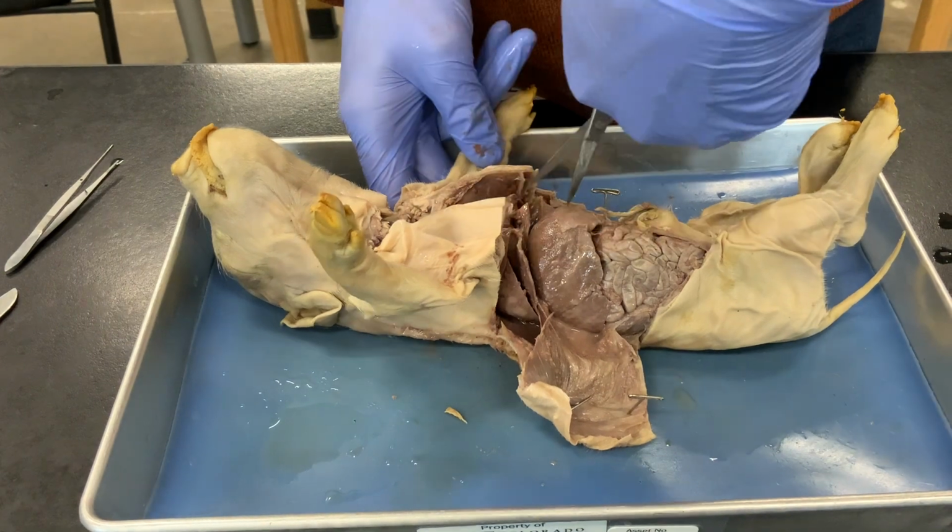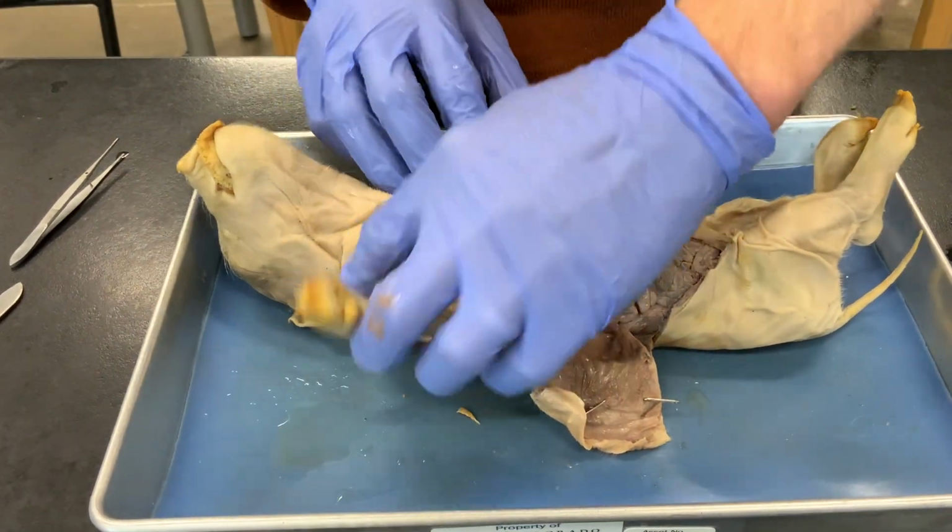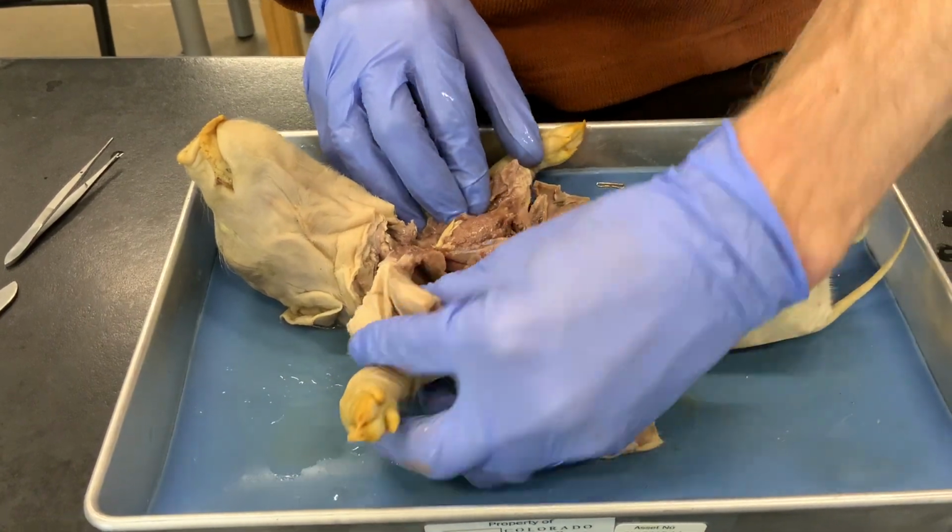And cutting membranes so that we don't tear any internal organs that we want to look at later as we open the body cavity.